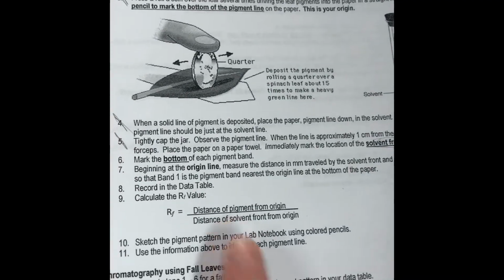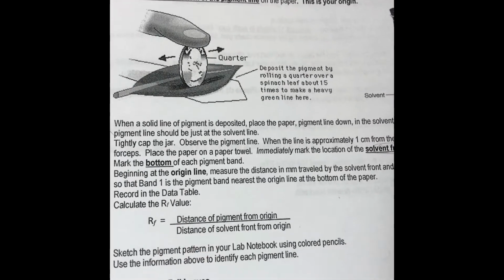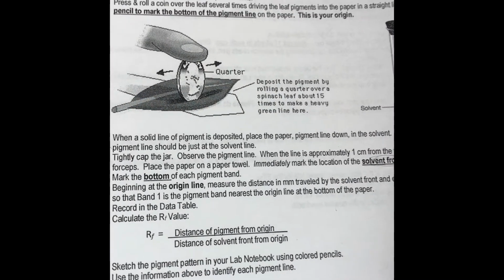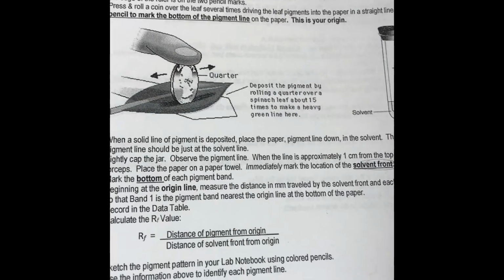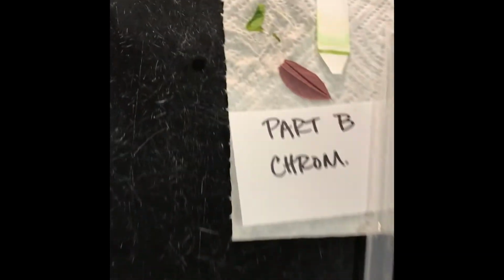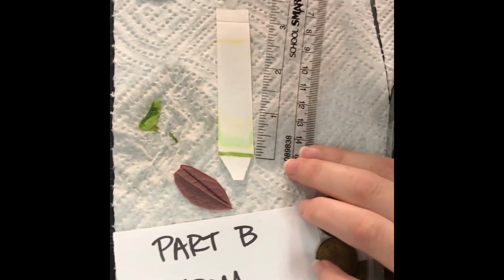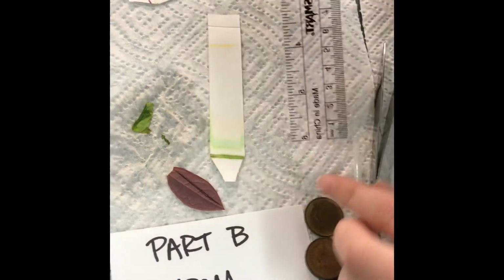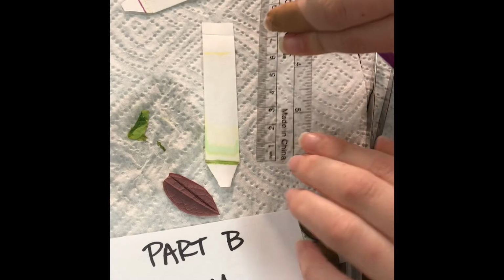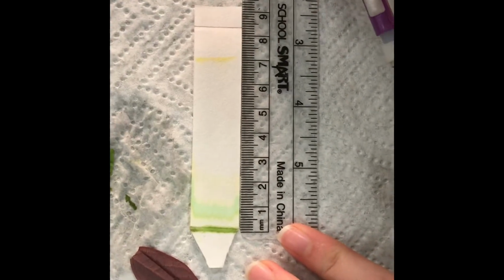So in the lab, you're going to be using the formula to calculate the RF value. The first thing you have to do, use your ruler, is measure the distance in millimeters from the origin to the solvent line. So take your ruler and go from the origin, the base pigment line. Just flip your ruler around so we use millimeters. There you go. Perfect. So we're going to go up to that solvent line.